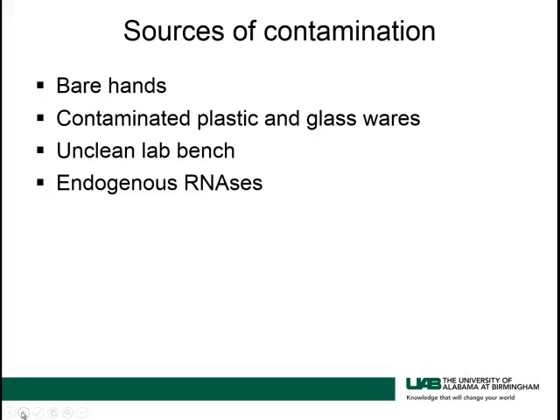What are the sources of contamination by RNases? Well, number one, bare hands. You will know that when somebody is doing a lot of RNA work and you open a drawer and touch their tubes and their reagents with bare hands, they will yell at you. There's a reason for that. It's very difficult to inactivate RNases.